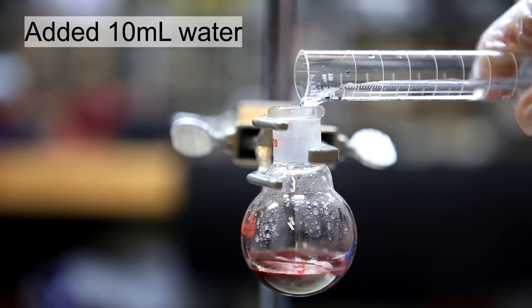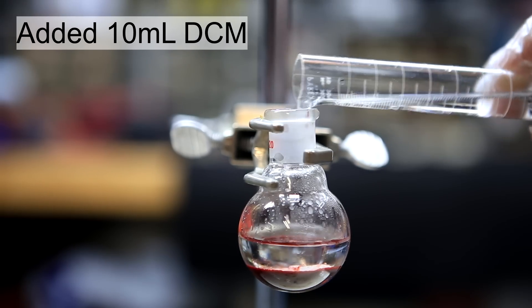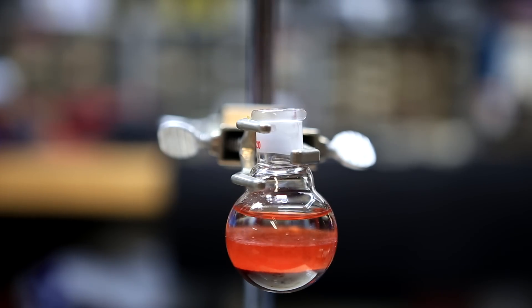Once it had cooled, 10 ml of distilled water was added. This was followed by 10 ml of dichloromethane. After the addition of both the water and the dichloromethane, we have an interesting 3 layered mixture.